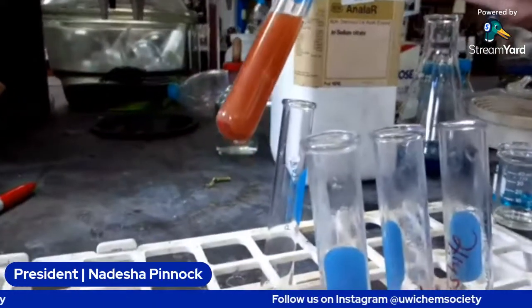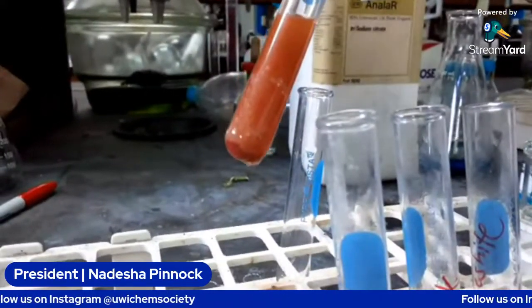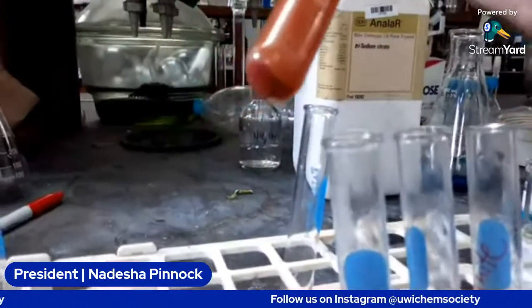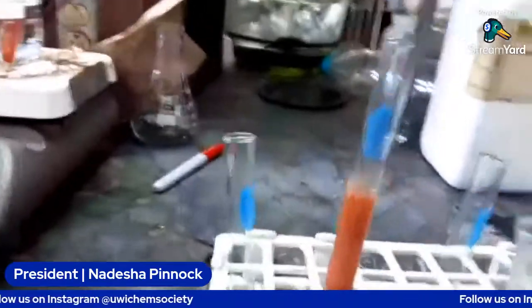So the solution is bright orange. Remember we talked about the results of percentage sugar: low, moderate, high. And then you can see the precipitate at the bottom of the test tube. So let me look at another one.